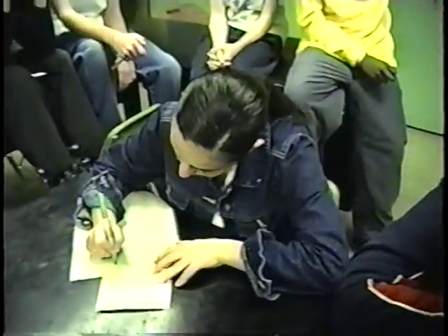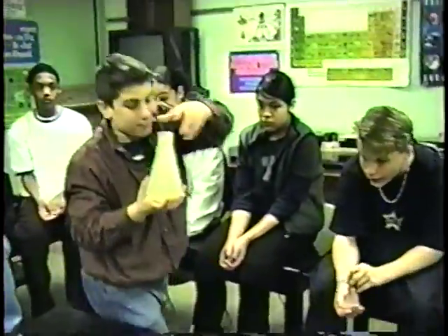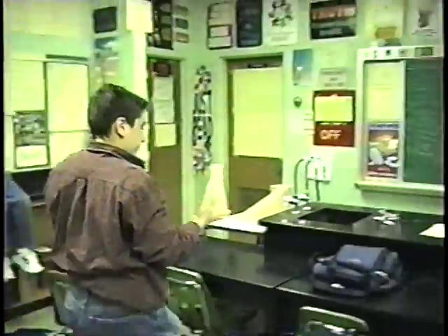0.006. Very good. So if you would put down for liters, 0.006. So now we have half of what we have to do. The other half is the weight. That's where Frankie comes in. If you could pass, oh, you got to get the thing back out of there. Phil, do the magic for us.